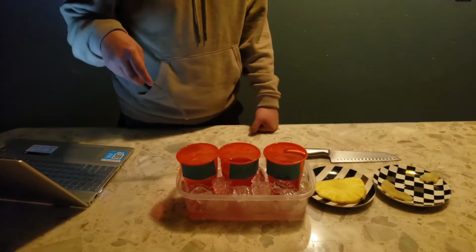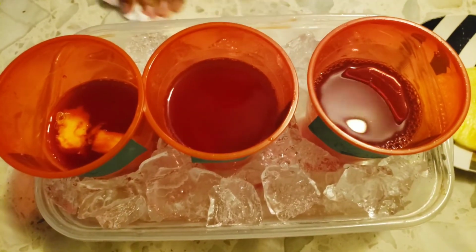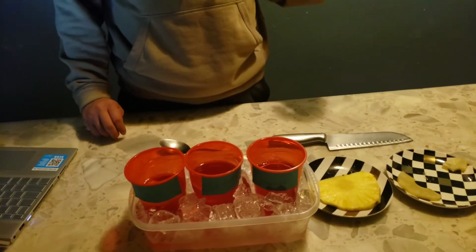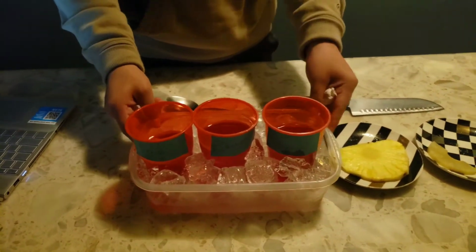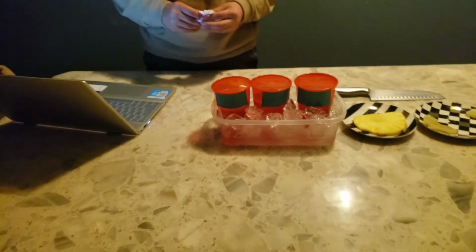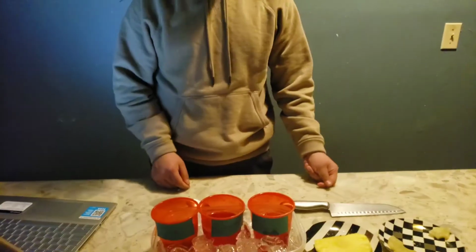It has been 8 minutes, and the solution remains the same. Fresh pineapple is still floating, and the canned pineapple has sunken. Both the solutions have gotten colder. When I poured the gelatin in, it had just been boiled, and throughout the 8 minute span, the temperature in the solutions has decreased.